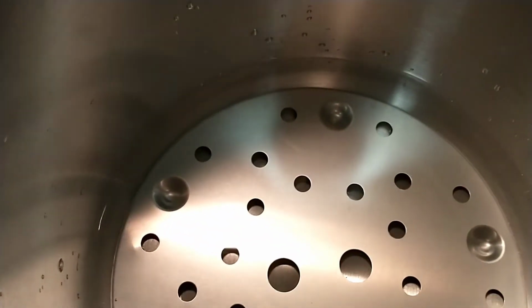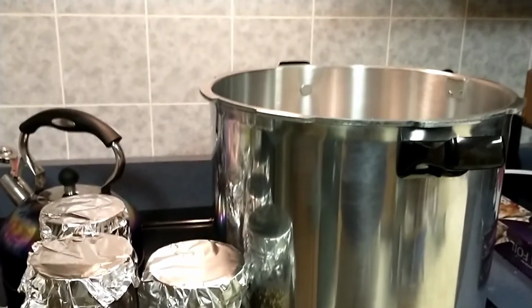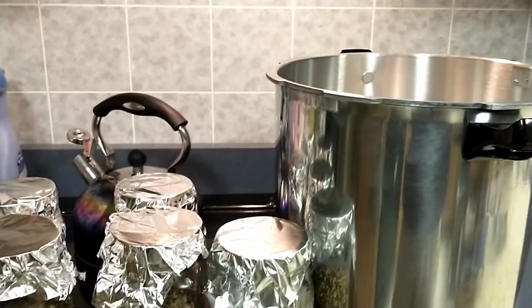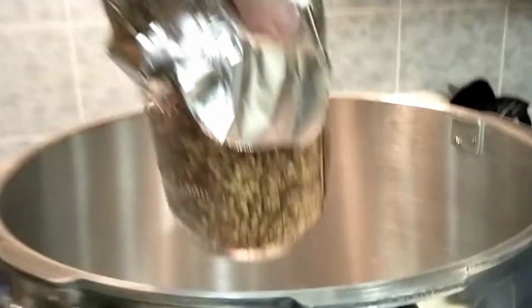And in my pressure canner, there are 3 quarts of water per the directions in my booklet. Make sure that you read the booklet for your particular pressure canner so that you know how they operate and what you're supposed to be doing with them. Mine is a Presto 23 quart pressure canner. And now I'm going to just put my jars inside.